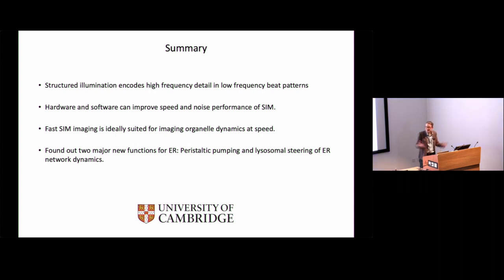The way structured illumination microscopy works is by generating frequency beats, and you use these machine learning methods to actually reconstruct very quickly in multiple colors. And these methods, which are definitely very intermediate on the super resolution scale, allow you to find out new things in living cells.